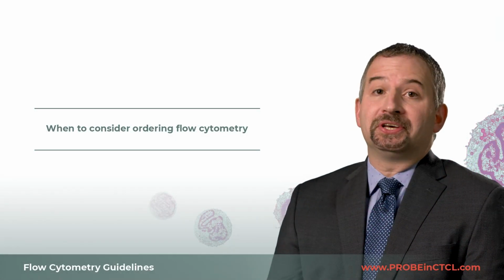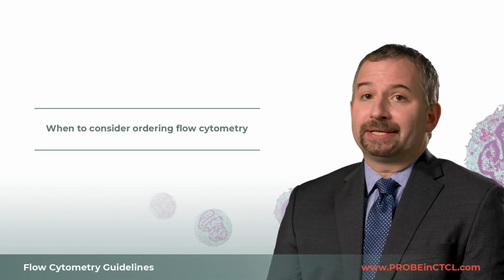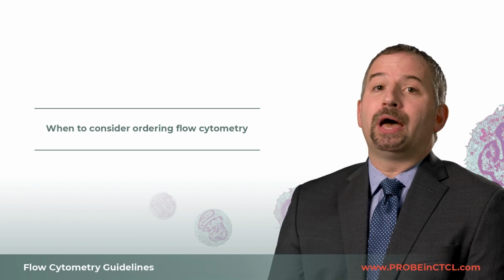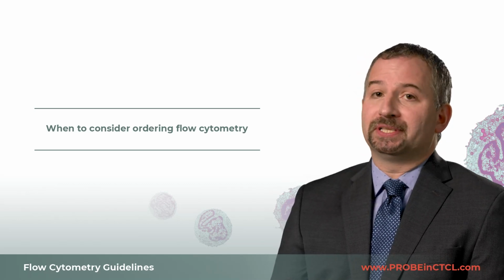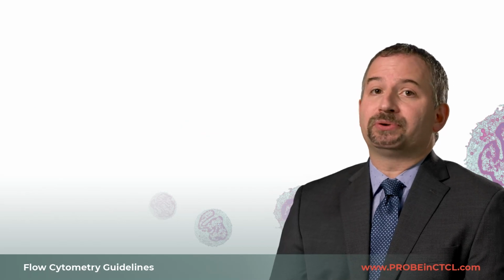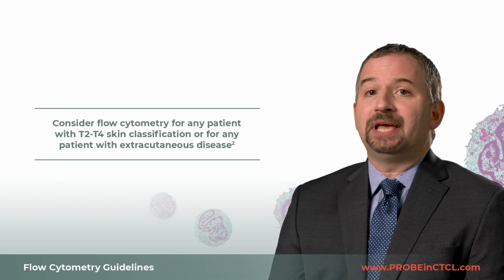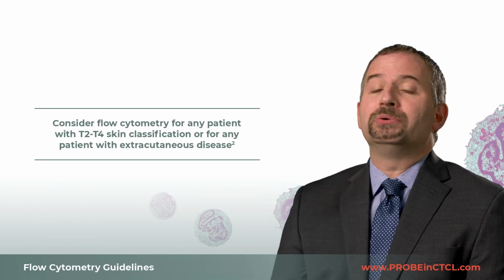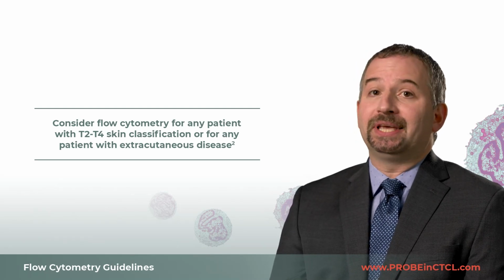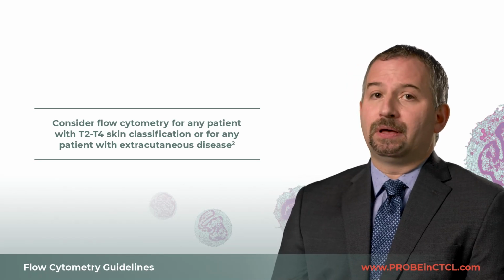So when might you consider ordering flow cytometry? European guidelines like ESMO and EORTC recommend flow cytometry for measuring blood involvement at all stages of Mycosis fungoides and Sézary syndrome. The NCCN guidelines state that flow cytometry may be useful at diagnosis. Additionally, NCCN recommends that flow cytometry be included in the workup for any patients with T2 to T4 skin classification and any suspected extracutaneous disease.